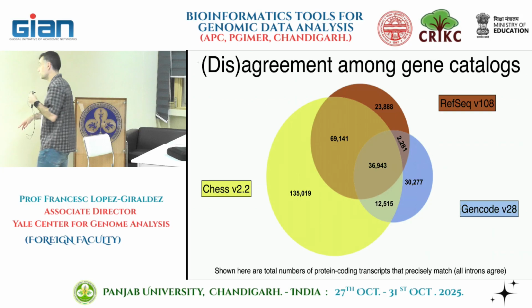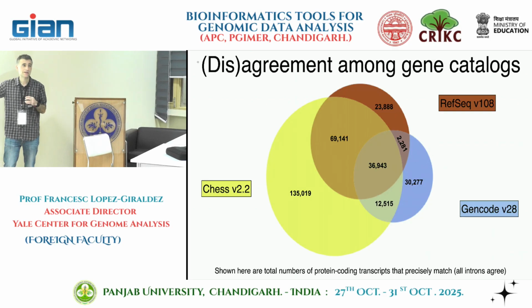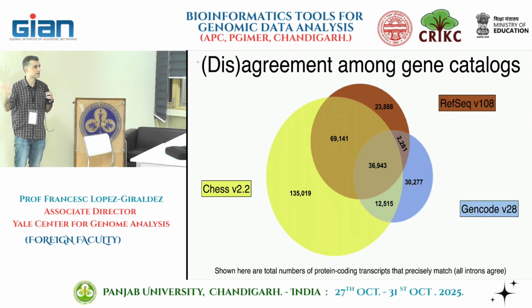Again, I don't remember either what it means, a precise match. I mean, they could be really strict, right? If one base is off, we call it's not a match, right? So one base is not going to make a difference in your analysis.